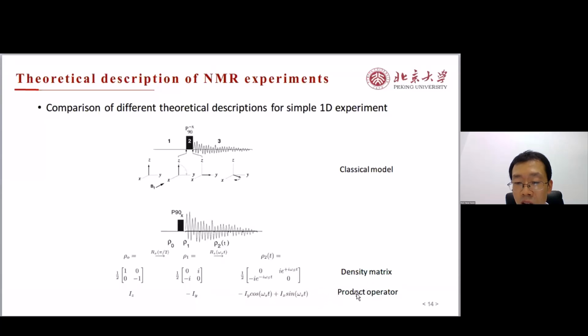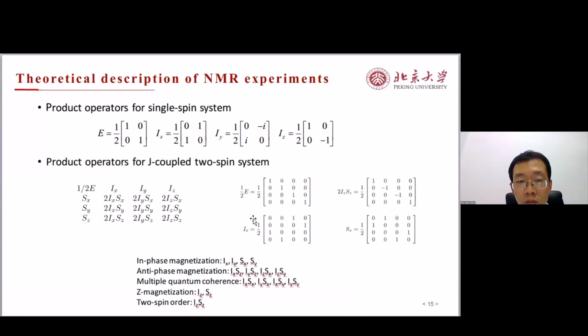The product operator is also shown at the bottom. So the operator is just the response to the density matrix in this. So let's look at the relationship between the density matrix and the product operator in more detail.